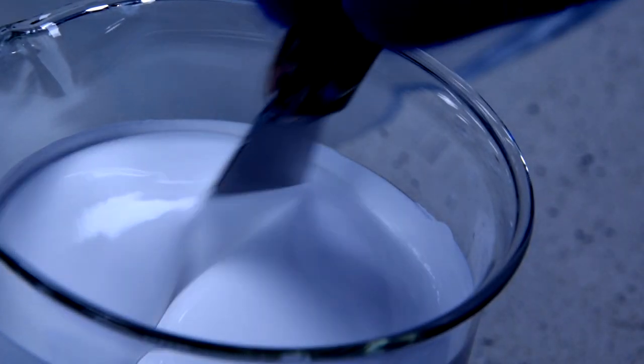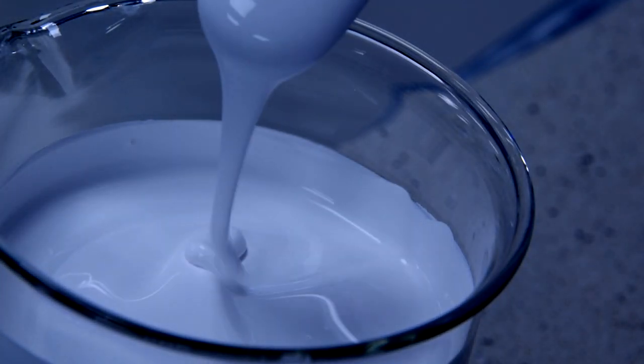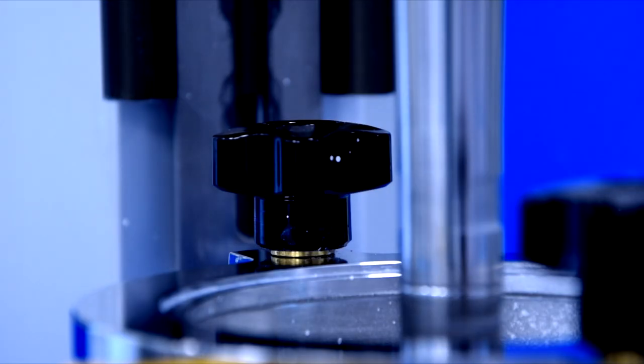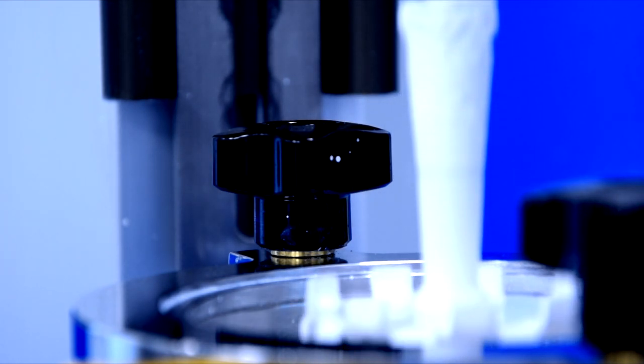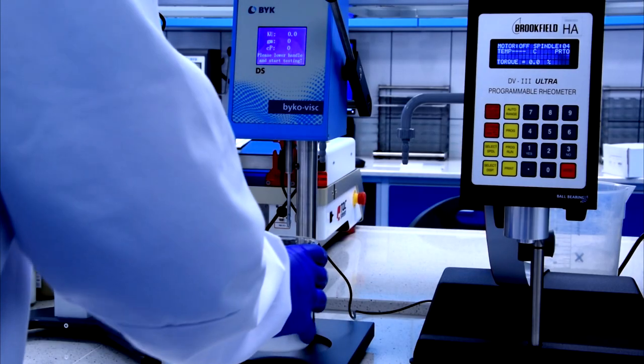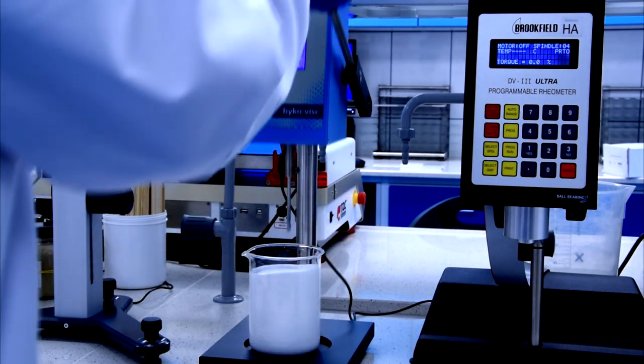Case studies that we conduct in our lab serve to provide knowledge for technical marketing of suppliers of raw materials for production of paints, in this case thickeners, and also concern thickeners with effectiveness in the area of mid and low shear forces.